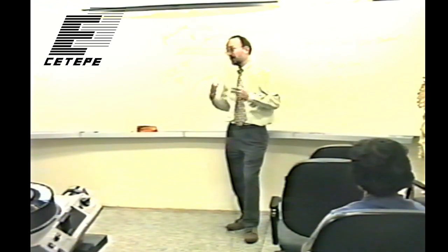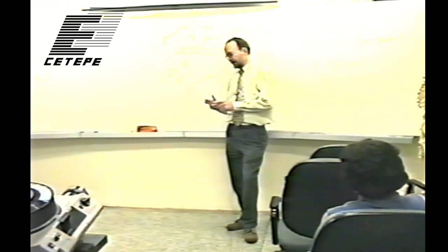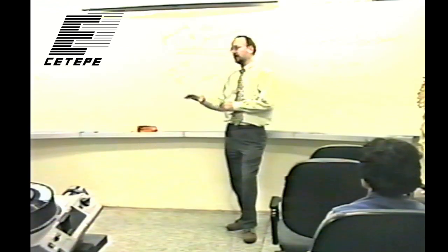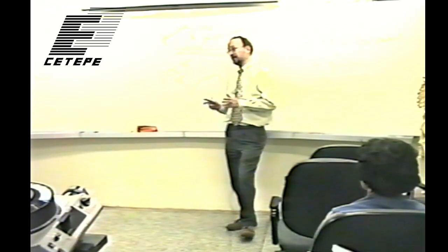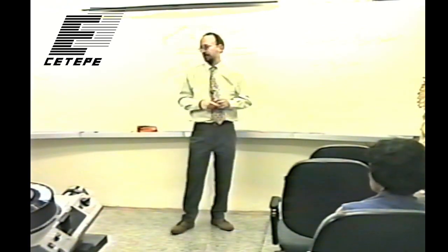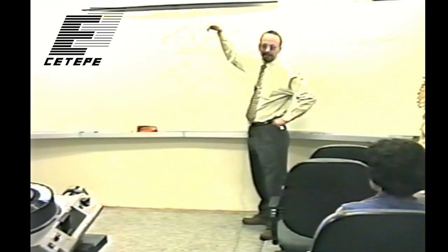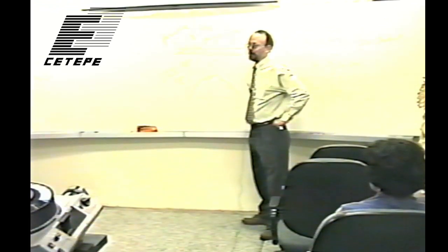And so the yield of these chips is extremely low. Last time I priced them, a 50 millimeter by 50 millimeter front illuminated CCD was about $50,000, and a 50 millimeter by 50 millimeter back illuminated CCD was over $1 million. They have them on this space-based X-ray observatory, they use them there. But that's, I think, because the whole rocket that sends the thing up there probably costs $1 billion.